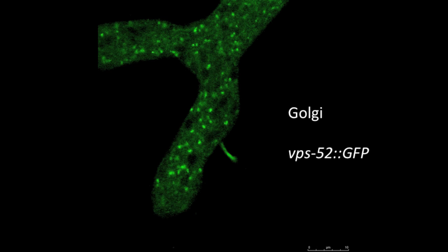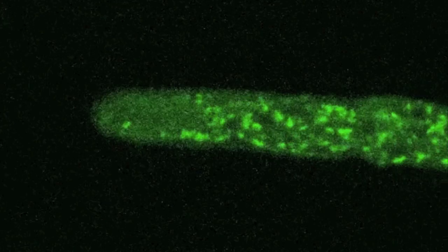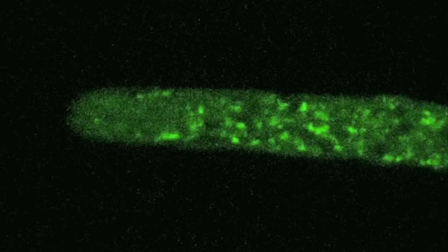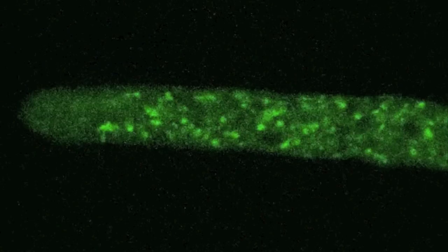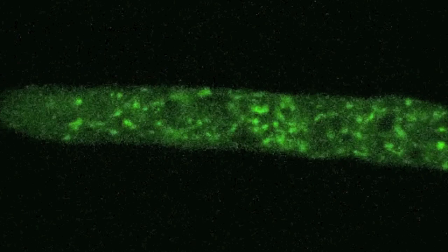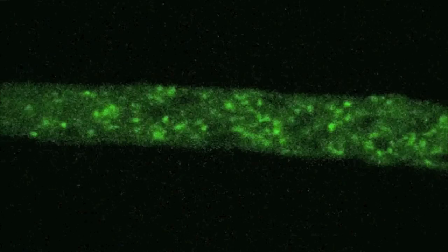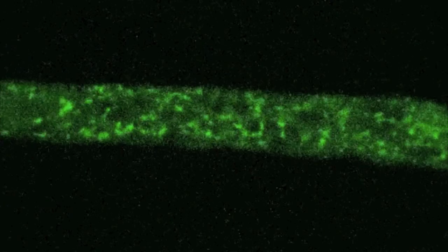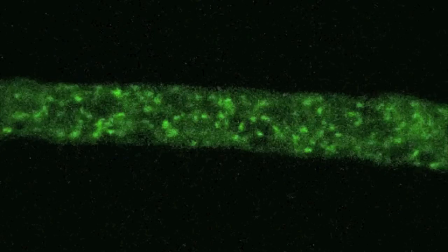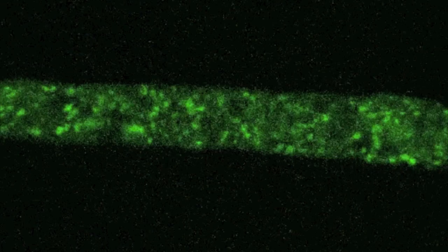In Golgi, proteins are modified and packaged. Golgi in Neurospora are small, rather irregular vesicles. They're most abundant near the hyphal tip. Interestingly, different Golgi proteins appear in different non-overlapping compartments, and the real structure of Golgi in filamentous fungi is poorly understood.